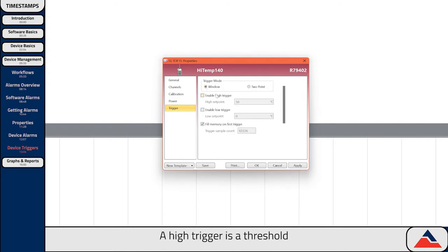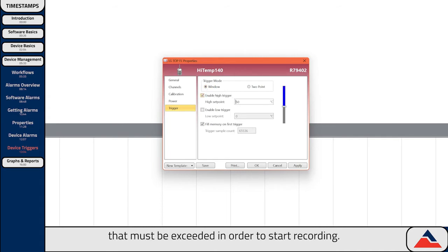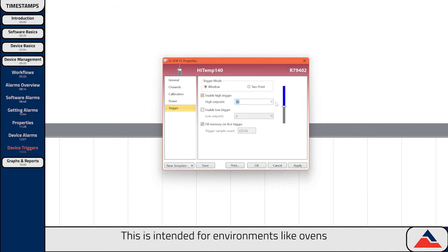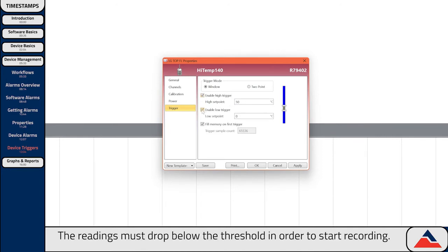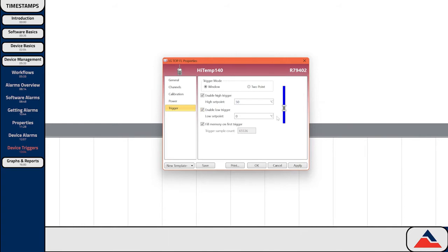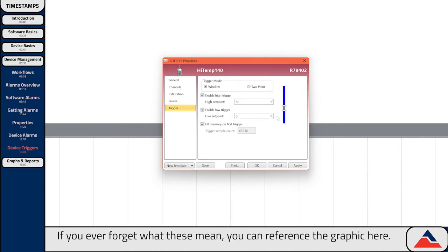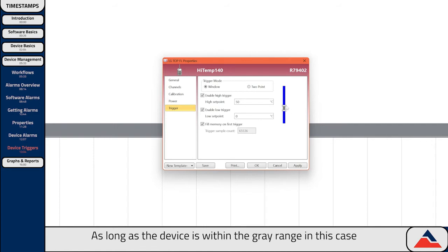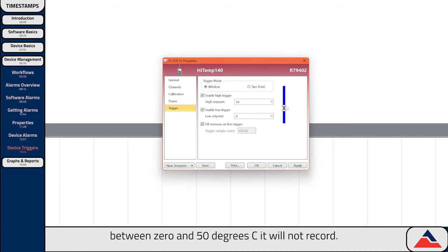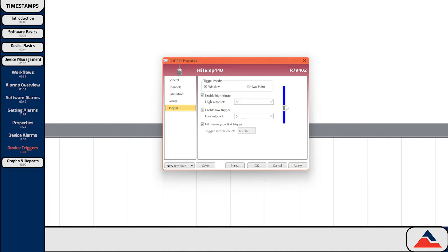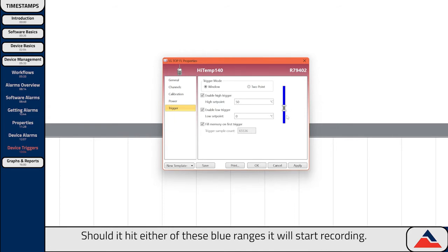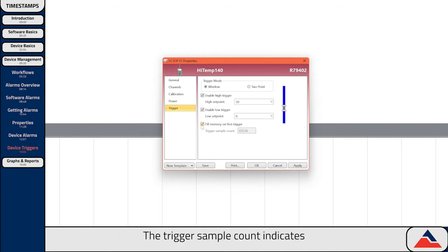In window mode, there are two options. A high trigger is a threshold that must be exceeded in order to start recording — this is intended for environments like ovens where your variables will be increasing. A low trigger is the opposite — the readings must drop below the threshold in order to start recording, intended for environments like freezers. As long as the device is within the gray range, in this case between 0 and 50 degrees C, it will not record. Should it hit either of the blue ranges, it will start recording. The trigger's sample count indicates how many readings the device will record after a trigger before stopping.